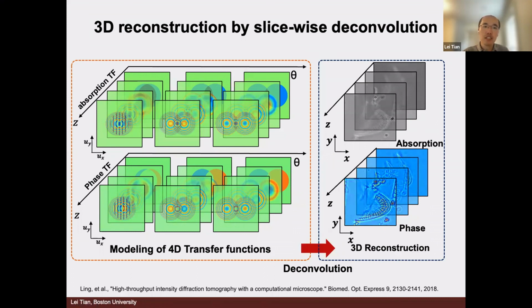In one of our tests, I believe in this 2018 paper, we imaged a one-stain sample and highlighted that in the reconstruction, indeed, we can separate the stained part and unstained part. I think that was on one of the algae samples. They have this natural greenish staining. So if you think about pollen versus algae, maybe they are comparable. I don't know, but that's my rough guess.